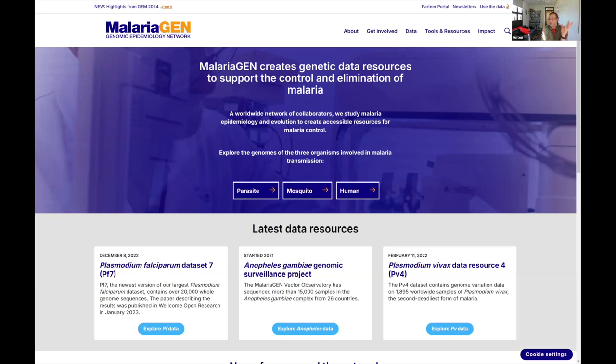There are different ways to answer that question. One of the ways is to look at the basic quality statistics for these genomes, and the number of contigs can be taken as an indirect measure of this.